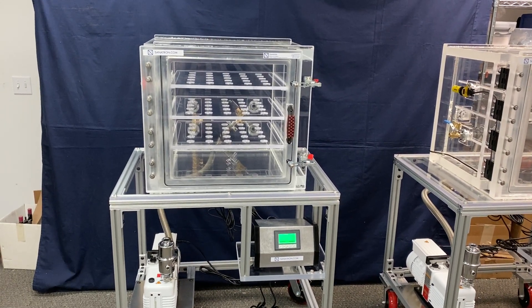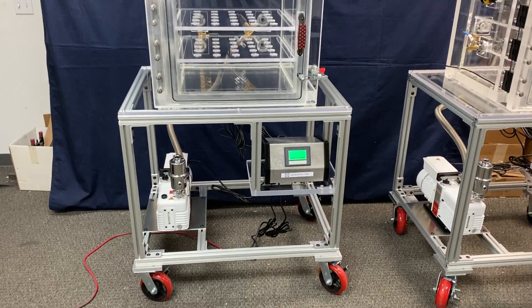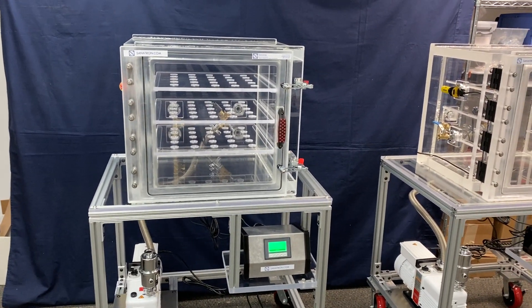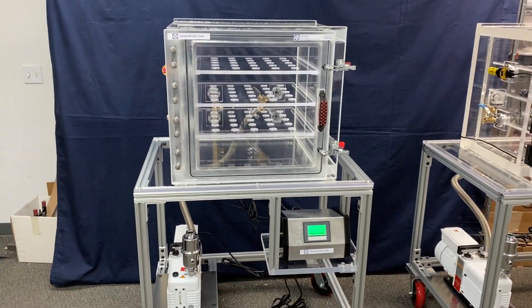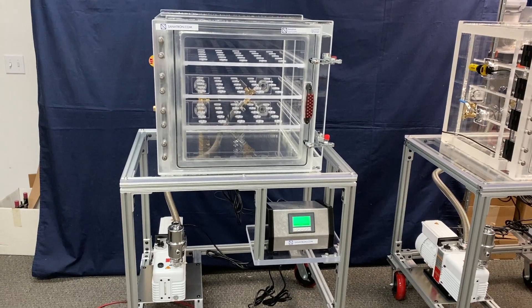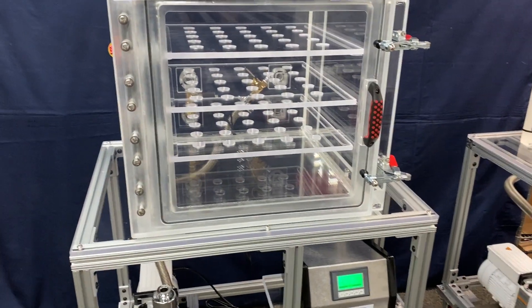Hello, and welcome back to another one of our videos where we show off how wonderful our products are and all the cool stuff that we built and make. Today we have an altitude simulation testing system. We actually have two of these — they're identical — but we're going to focus on this one because it's plugged in. Let's go over some components and get it running, and I'll show you how the system works towards the end of the video.